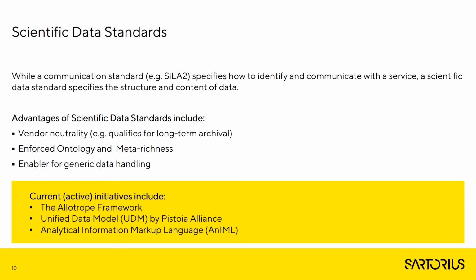They can be seen as an enabler for generic data handling, in which pre-built data manipulating components can be composed to form a holistic data wrangling pipeline. This is in contrast with the current case-by-case way of handling data processing due to non-agreed standards. Currently active initiatives include the work around the Allotrope framework, the unified data model proposed by the Pistoia Alliance, and the Analytical Information Markup Language, AnIML.